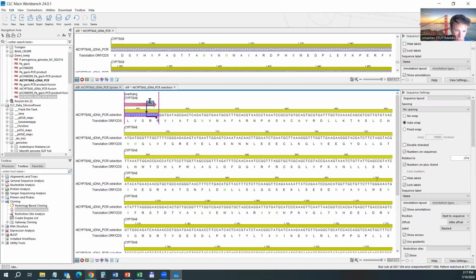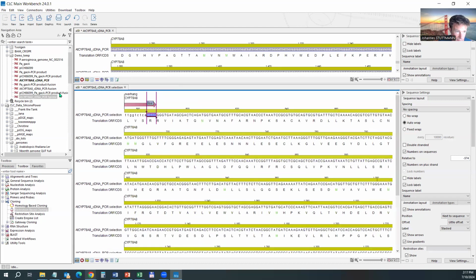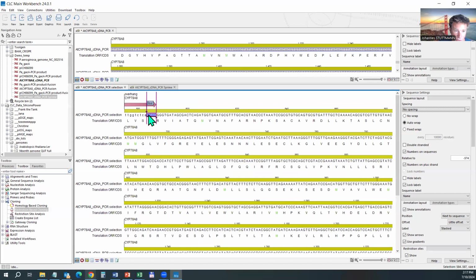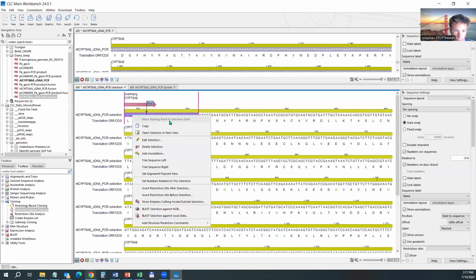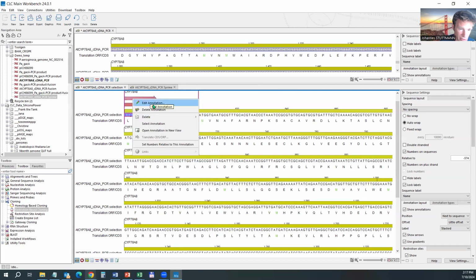So there we go. It's CGAC, and it also was sometimes the restriction sites are not shown anymore, and what you need to do is just close the file, reopen the file. Here it's also CGAC, so this fits. This is correct. Again, I need a primer, so here we have a lot of GC, maybe until here. So this would be my primer number 8.